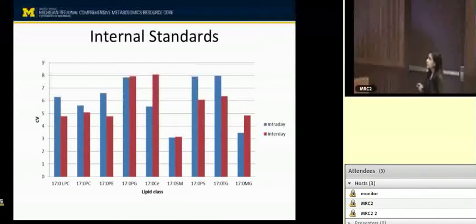Sometimes the data is so good that we don't even need to normalize it to internal standards. Just any transformation, like a variance minimizing transformation, can work pretty well with the data, and you can just start the data analysis. But we use relative response to internal standard, class-wise or retention time based.